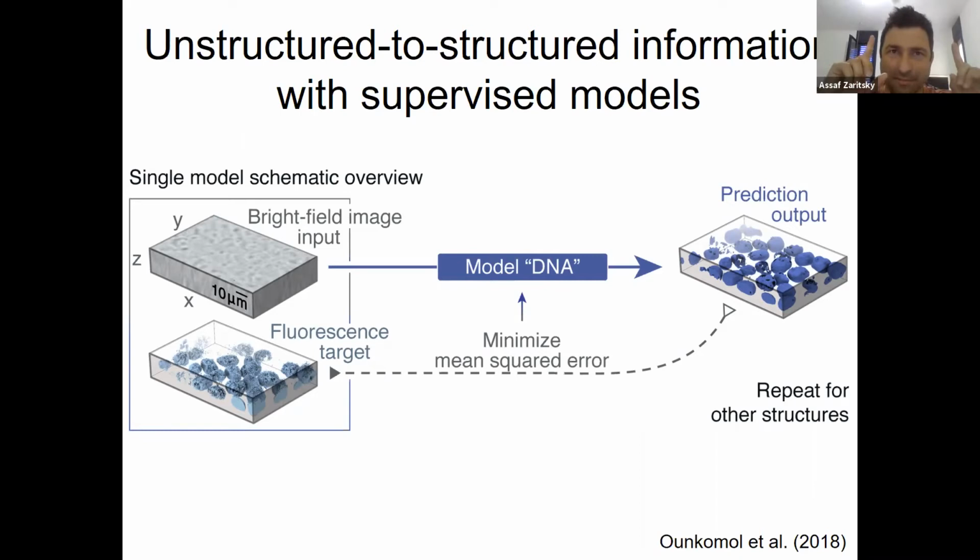But for the machine learning, you take a bright field image and you learn a mapping, a model that will take a bright field image and will generate from it a corresponding fluorescent image. And you use the ground truth here to train the network. So how do you build this model of the tagged image based on previous pictures? This is what we get from an experiment, but this is just the training.